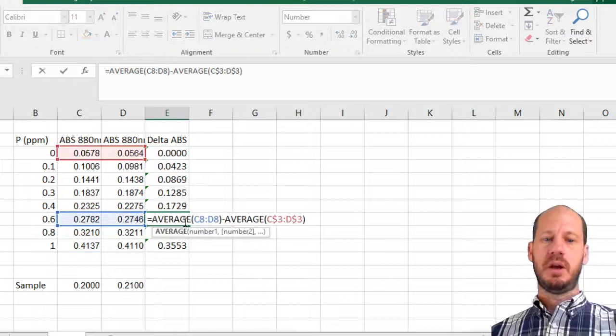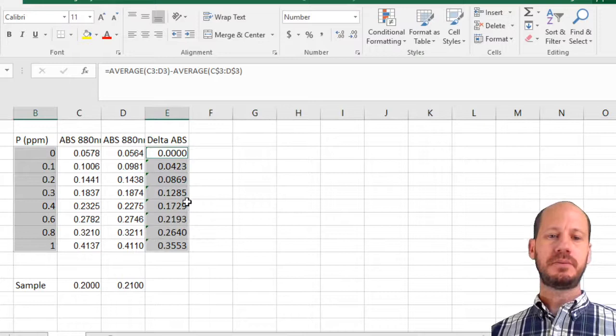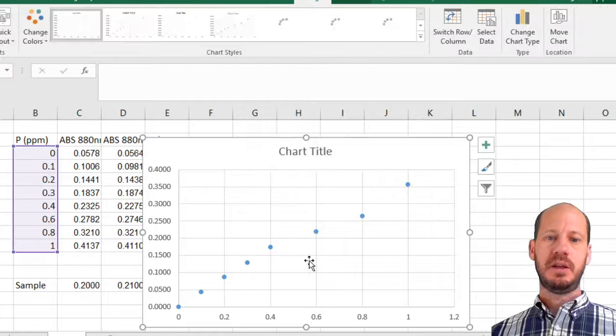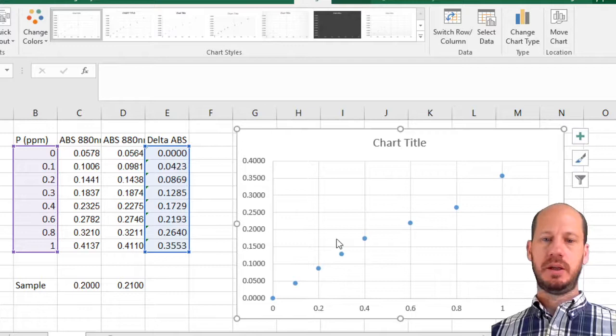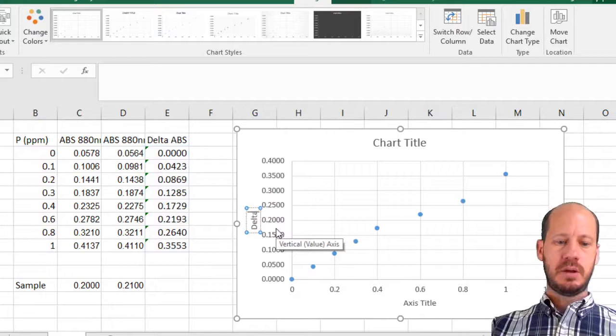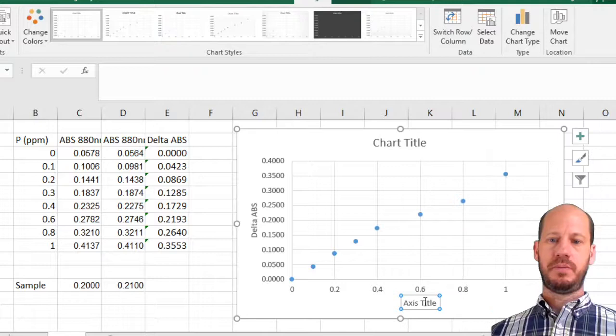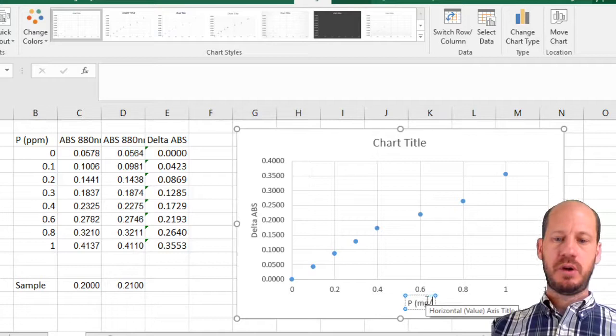If you drag it, you'll see that it's already subtracting always the zero, subtracting the blank. Every concentration is subtracting the blank. We're going to make a scatter plot between the concentration in ppm and the delta absorbance. You go insert a scatter plot. This is our standard curve from the data we got. Let's label things properly. The y-axis is delta absorbance. The x-axis is P concentration in ppm or milligrams per liter.